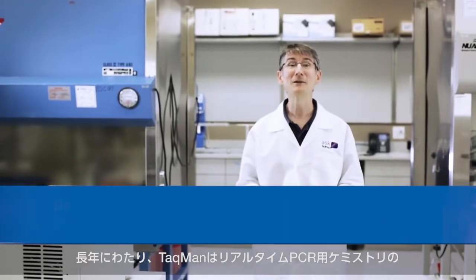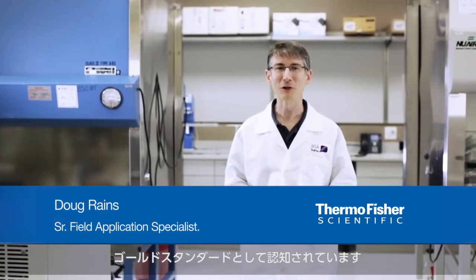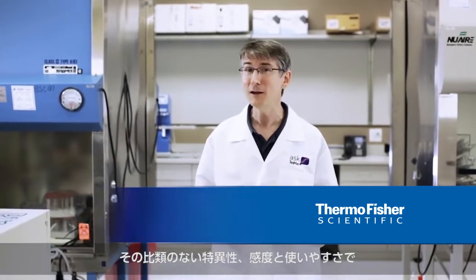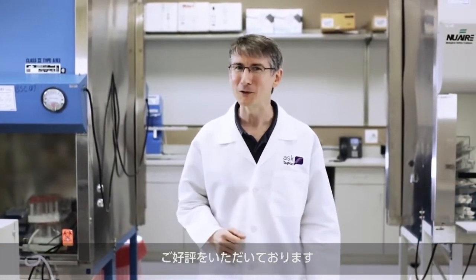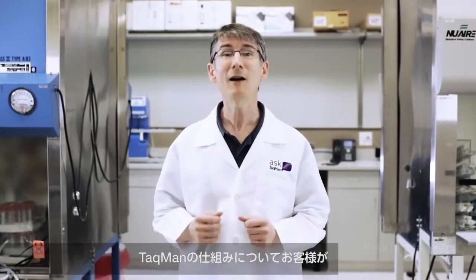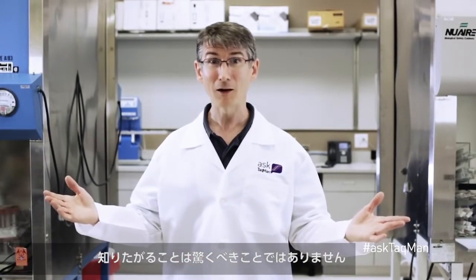For many years, TaqMan has been the gold standard chemistry for real-time PCR. It's famed for its unparalleled specificity, sensitivity, and ease of use. So it's not surprising that users want to know what Shrikant at ICL College in India asked recently — namely, how does TaqMan work? I'm glad you asked.